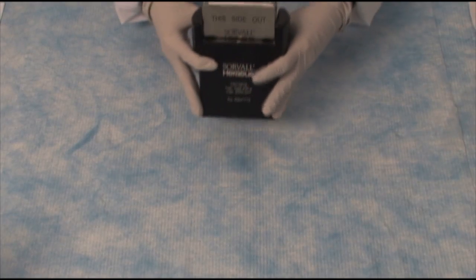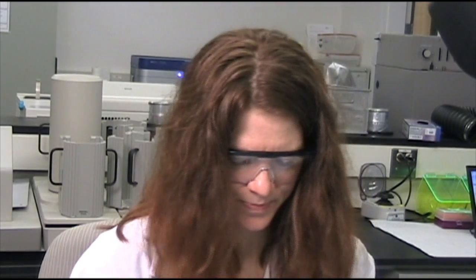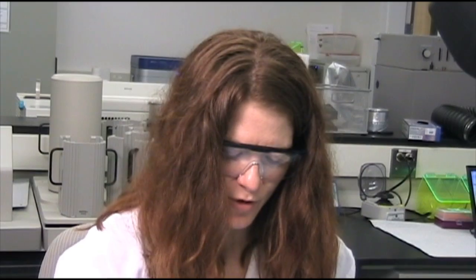Now we're back from the centrifuge. I'll remove my card. You can see that the liquid is here towards the bottom of the fill port — the rest of the liquid, which is the sample and the master mix, is now down into the card. And now we're ready to seal the card.